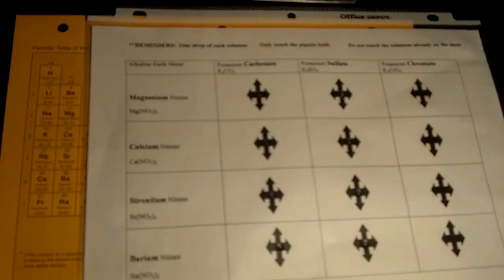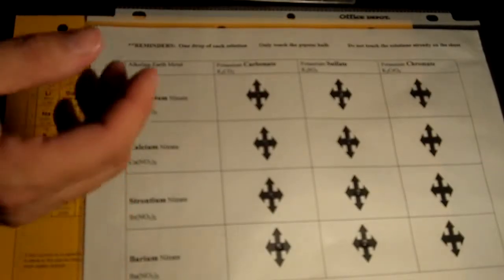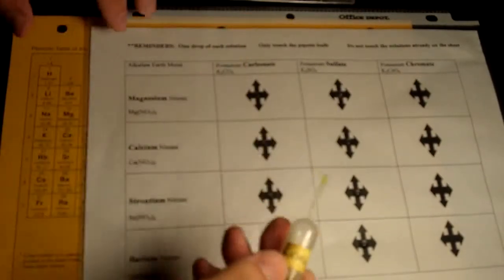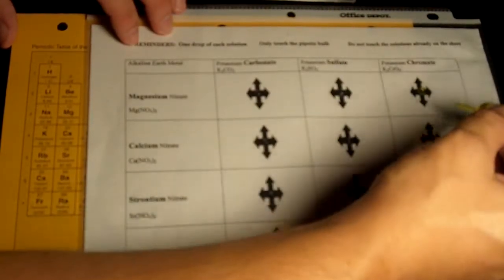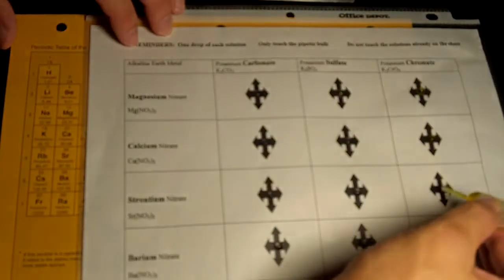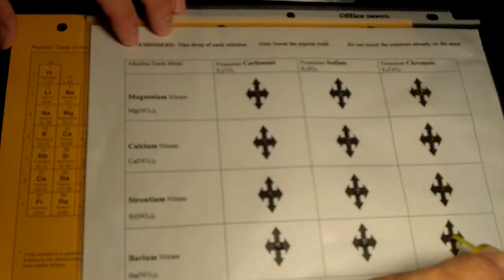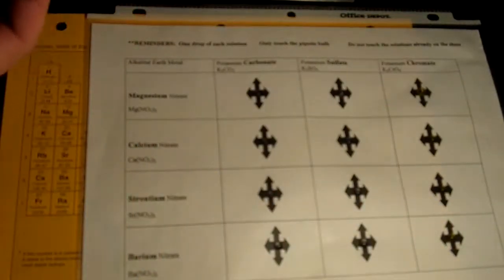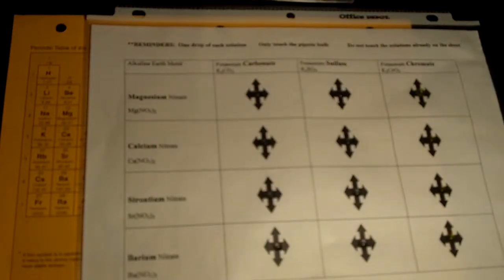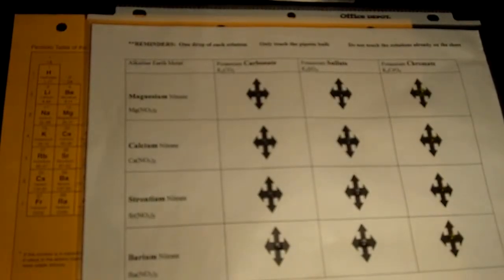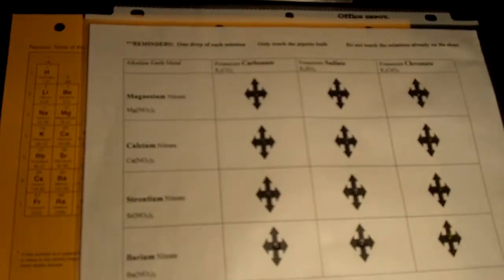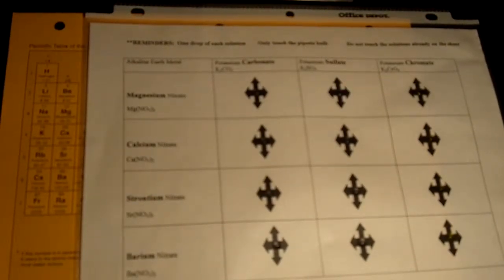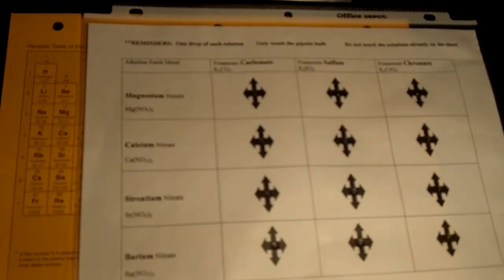And the last one, which is the yellow compound, this is the potassium chromate. One drop, again, on each of the surfaces, or each of the targets. Okay, now we're going to cross-react it with the alkaline earth metal. And again, what you're looking for is the presence of a precipitate. So, if you see a precipitate, then you're going to mark on your data table PPT. And remember, if there is no precipitate, you must leave the square blank. Don't write no reaction, don't put N/A or anything like that, just leave it blank.